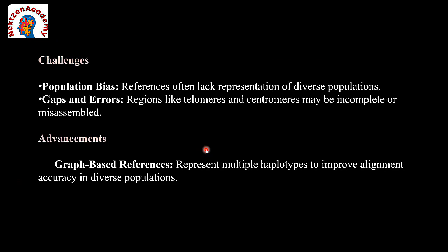The advantage is graph-based reference genomes, which is what that is all about.